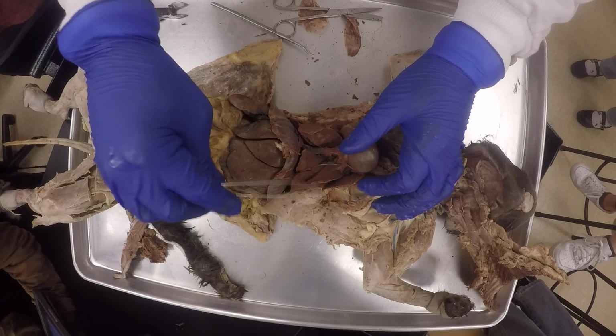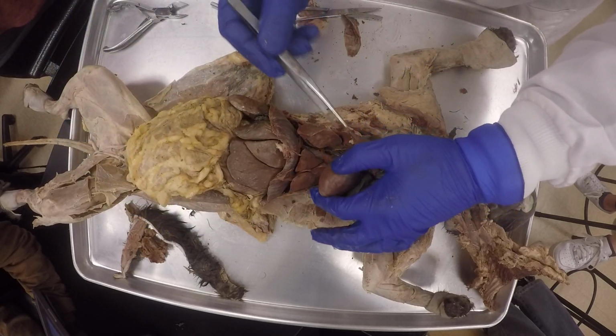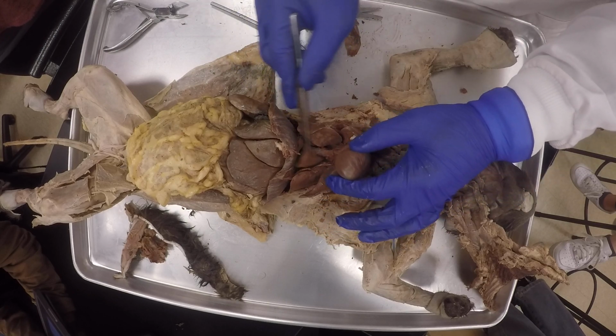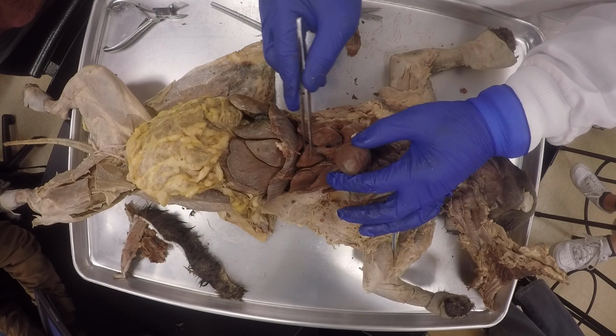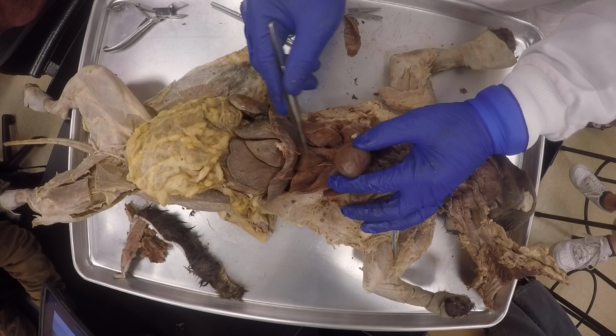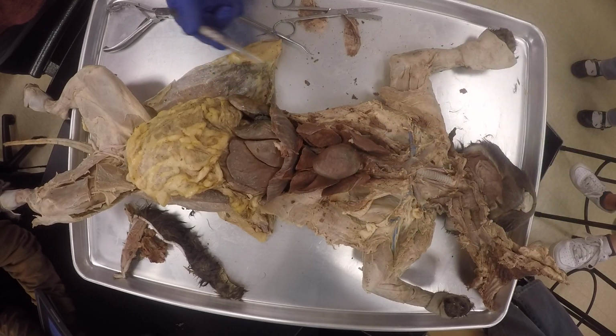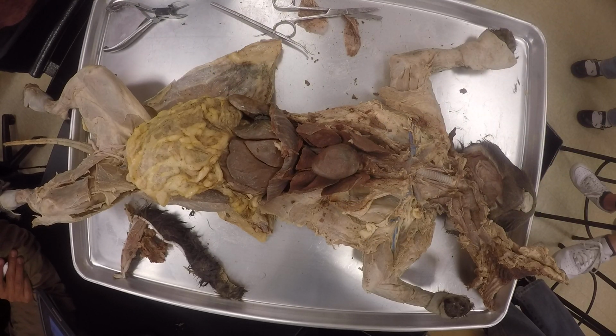I don't know if I did the left cardiac lobe, but here it is again if I didn't. And then finally the intermediate lobe, or the mediastinal lobe if you like, but intermediate is good enough for me. Intermediate lobe, and then finally the diaphragm. Those are the parts for the respiratory system, and we can kill the video now.